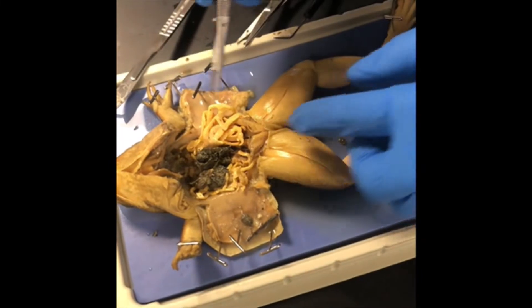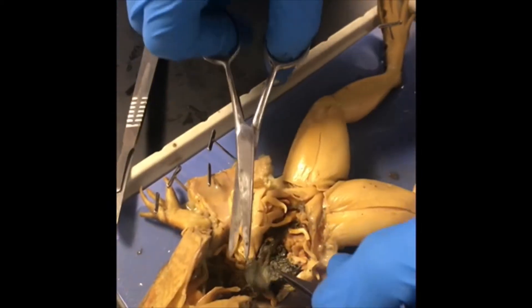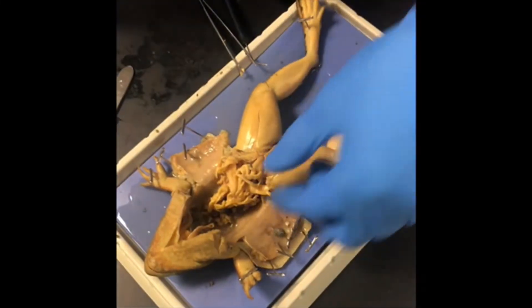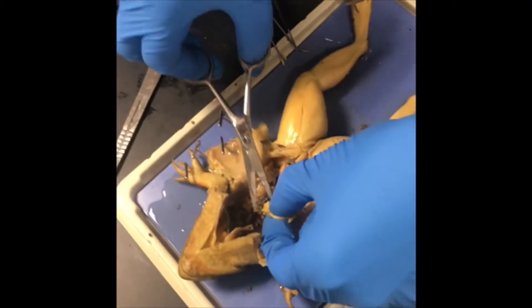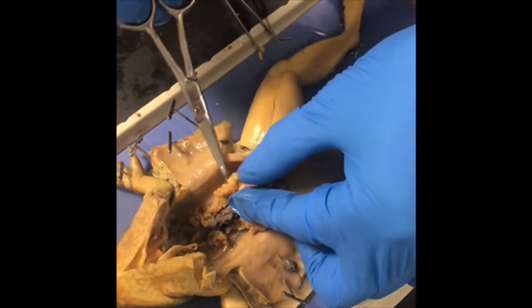We're going to identify whether our frog is male or female — our frog is female. Here are the ovaries that are filled with eggs. We're going to remove the ovaries. Next, we'll be removing the fat bodies. Since this is a female, these are the ovaries.